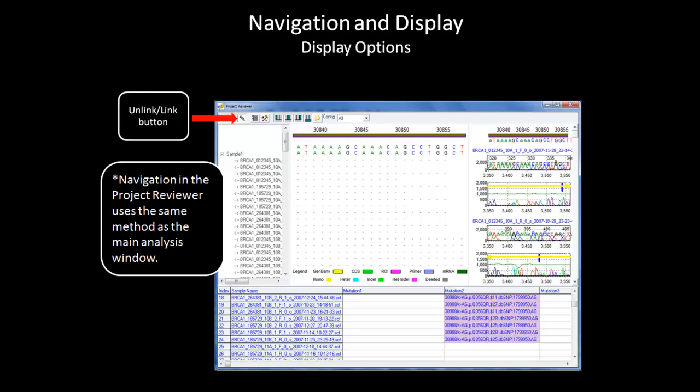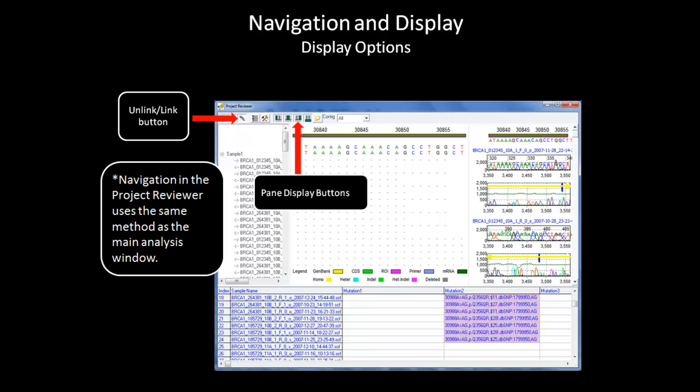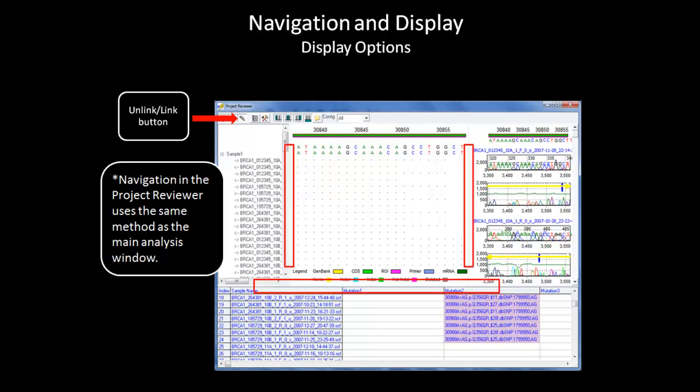First, there is the unlinked button. This button controls whether the entire viewer is linked. For example, if it is clicked off, you can zoom into the electropherogram without affecting the view of the base pane. The pane display button controls which panes are displayed and which are removed from the project reviewer. In addition, you can also resize any of the panes to the size you want by moving the pane dividers.